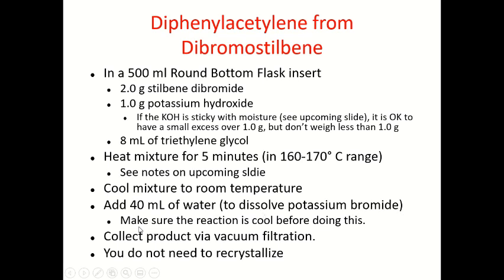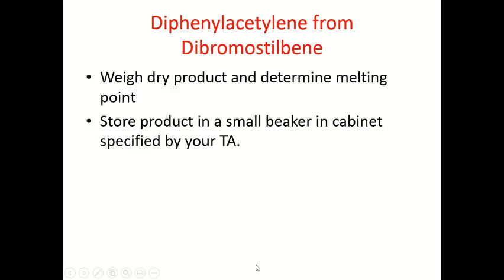In this case you have to make sure that the reaction is cool before, of course, adding the water. Collect the product via vacuum filtration, and you don't need to recrystallize it. Then you have to weigh the dry product and determine the melting point, and store the product in a small beaker in the cabinet specified by your TA.